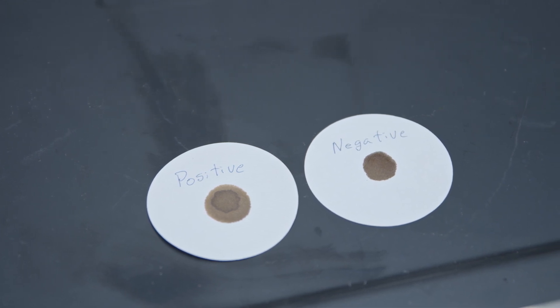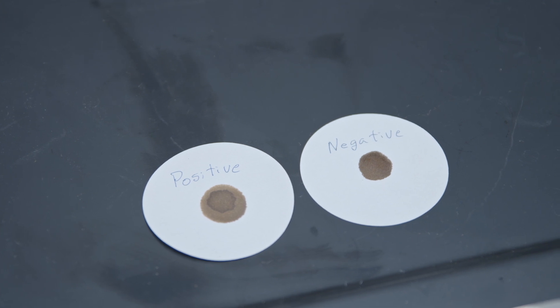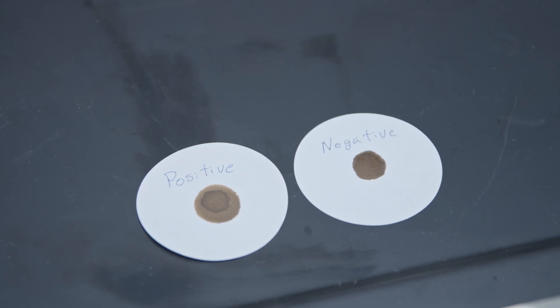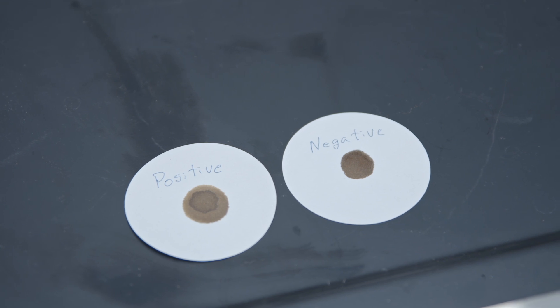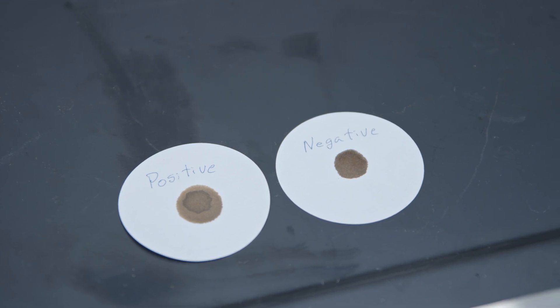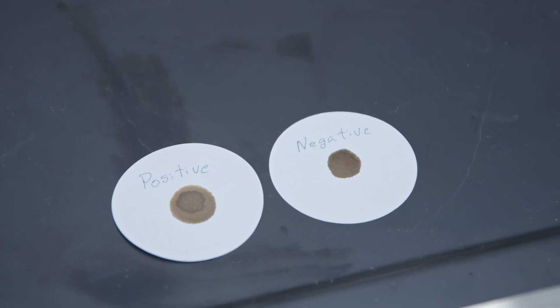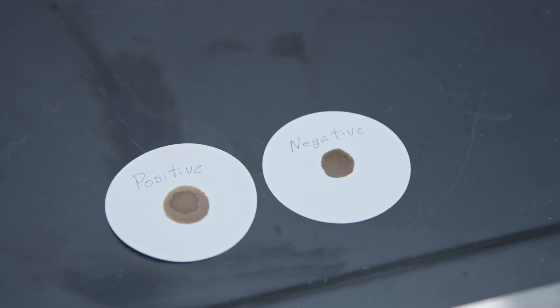If the drop forms a uniformly circular dark stain, report the test as negative. If the drop now forms a darker solid or annular nucleus with a brown or yellowish brown circular stain, it should be reported as positive.